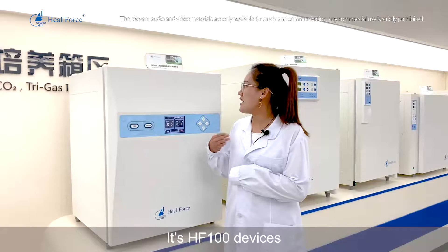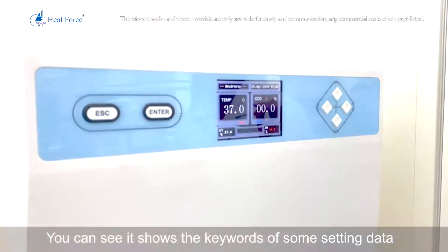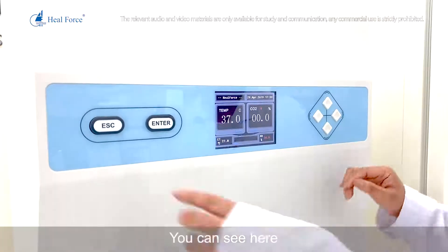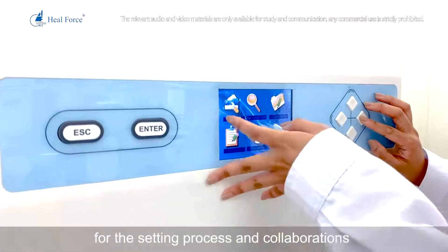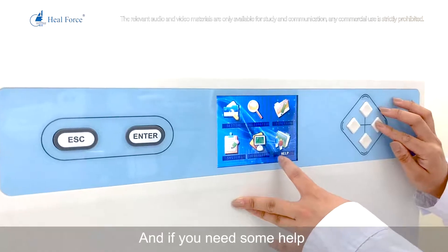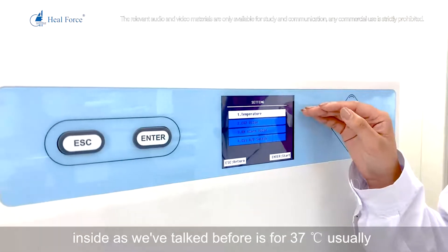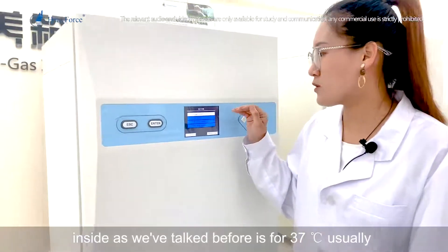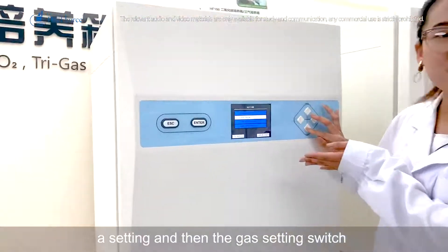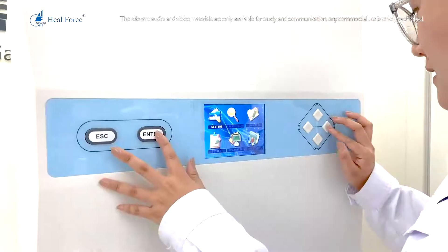The HF100 is equipped with a large colorful LED screen showing key setting data including temperature, carbon dioxide content, and other settings. You can access settings for calibration, functions, and system information, as well as a help section. In the first settings menu, you can set the internal temperature — typically 37 degrees Celsius — the carbon dioxide value, RH alarm setting, and gas switch settings. Gas A and gas B switches are provided to maintain a stable internal environment.